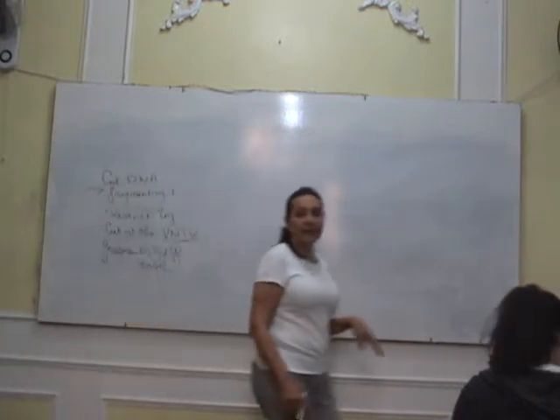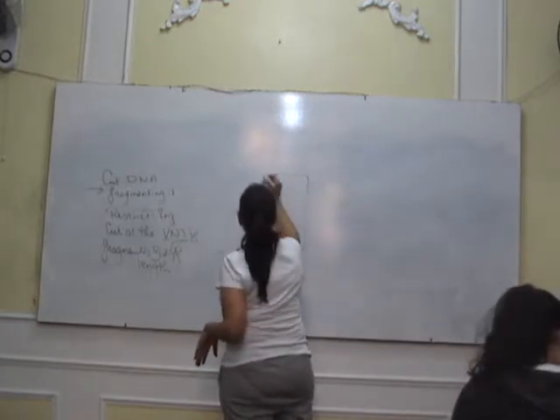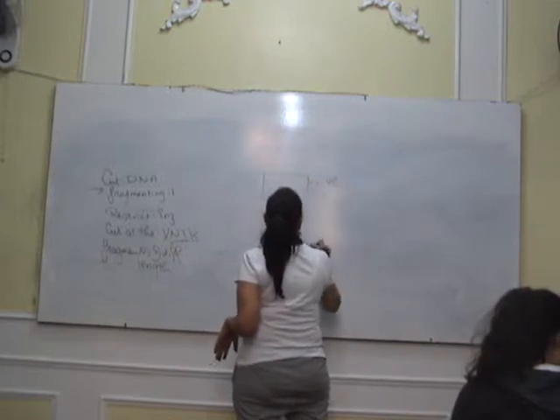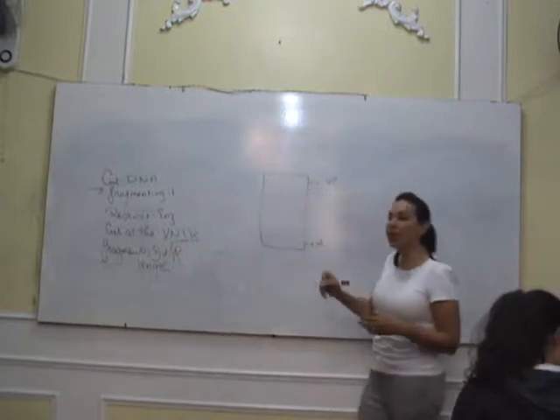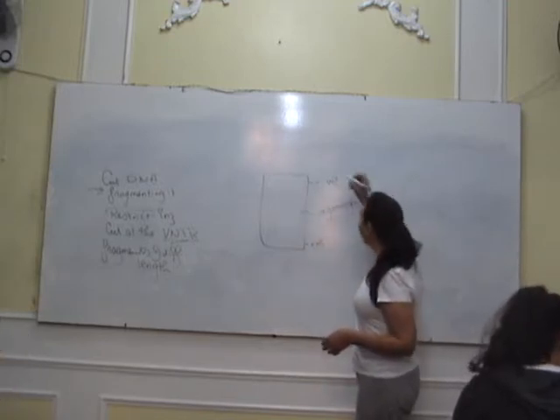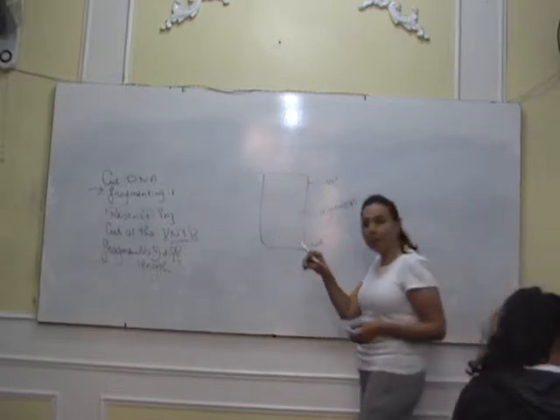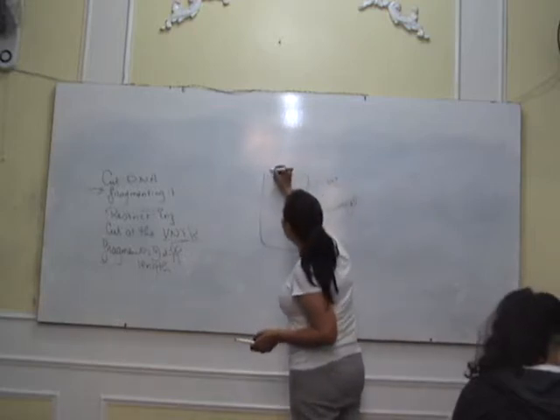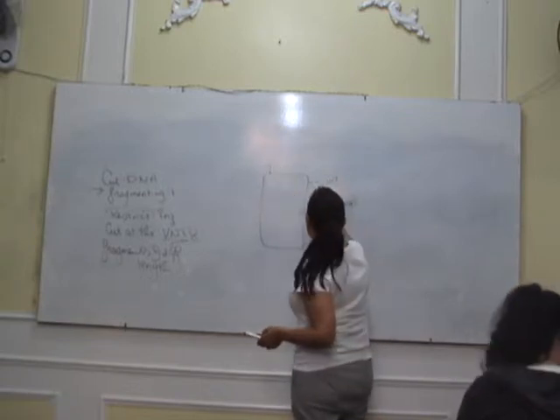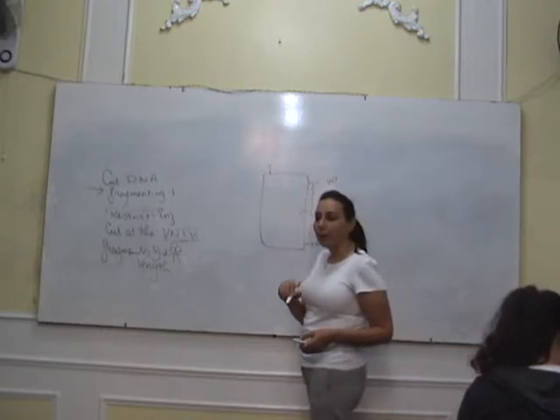After we fragment the DNA, we load it in the agarose gel, at the well at the cathode side. In gel electrophoresis, the gel is made of agarose and has wells in it. The wells are made by special forks, and the DNA is loaded at the cathode side in a buffer solution. Then an electric field is applied between the cathode and the anode.